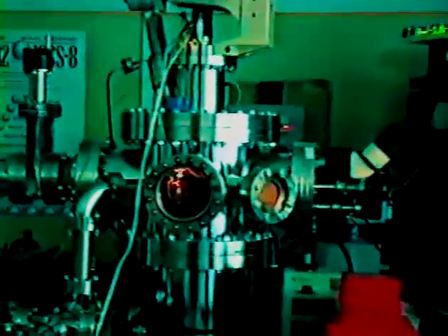This is a new machine. It contains some Auger and LEED apparatus here, and a mass spectrometer. Excuse me, János, I have promised to you. Here is László Deák. How do you do? He is working on this system, and I asked him to show you some excellent pictures obtained so far by STS. Do you have? Yes, I have. All right. And we can go into the first.